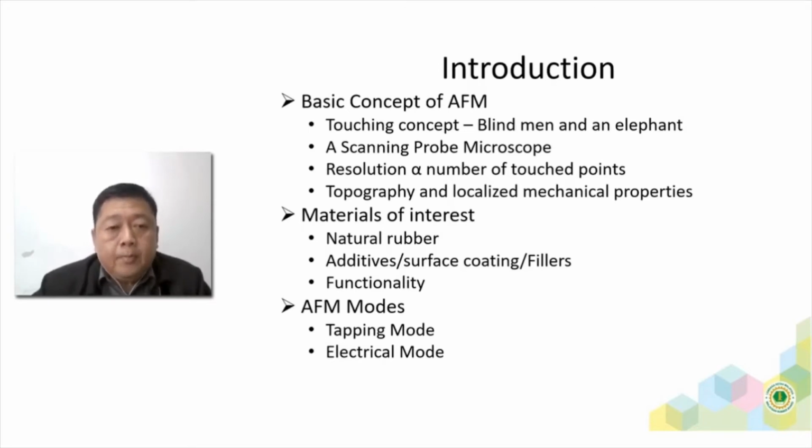In today's presentation, I will focus mainly on the product side, which is the thin film of natural rubber, such as gloves. The additives that we are using in this study, one of them is graphene. Graphene is the wonder material; everybody knows about it.